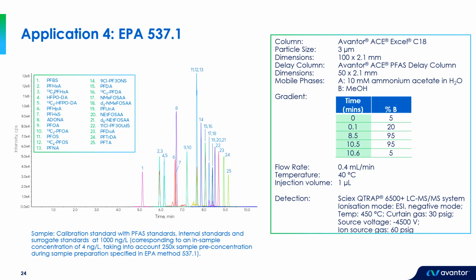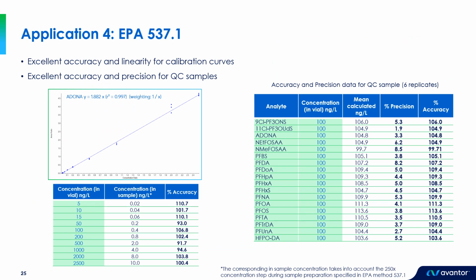Despite that small injection volume, you can see here for this sample, which corresponds to 4 parts per trillion concentration in the samples themselves, we're readily able to quantify down to the levels required by the regulators. And this method achieves excellent accuracy and linearity for the calibration curves.